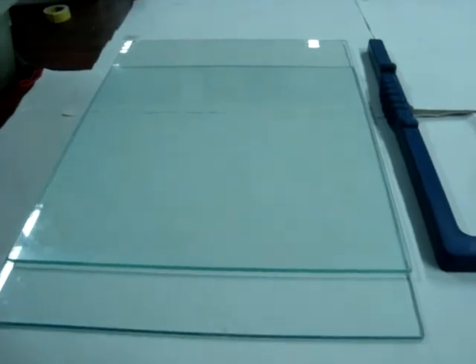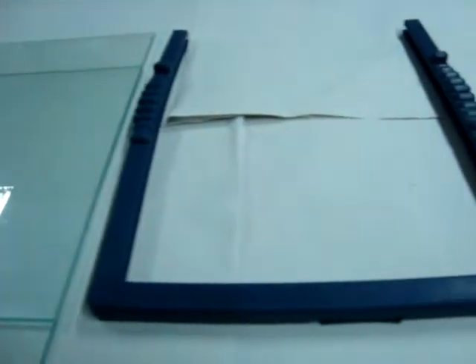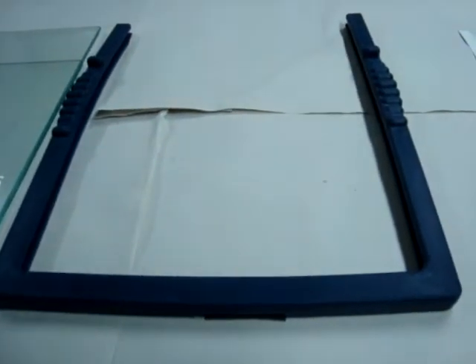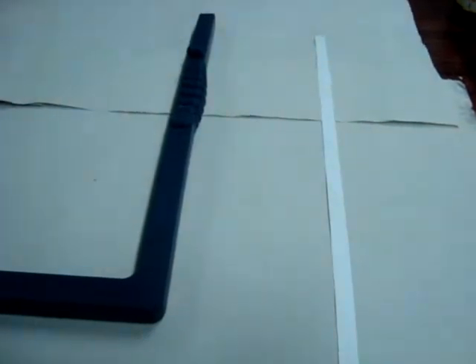Let's see the instruments required. This is the glass plate in which we will cast the gel. Clamps are used to hold the gel plates together, along with spacers. This is the Biometra unit in which we are going to perform this experiment.